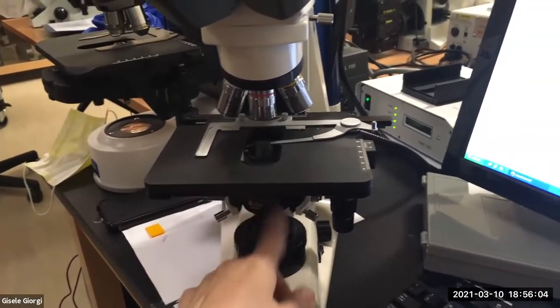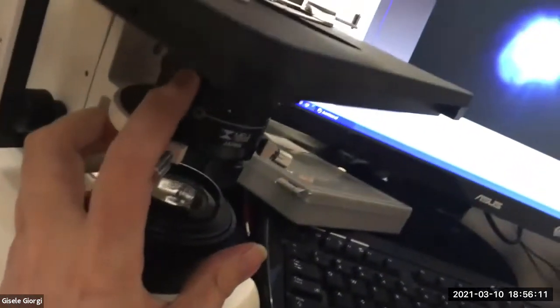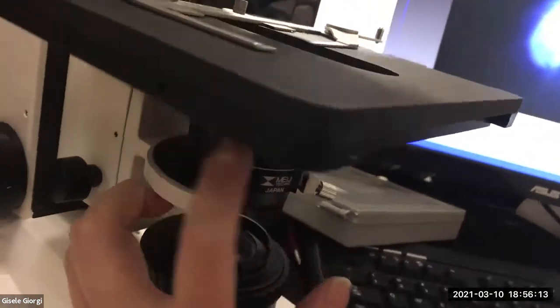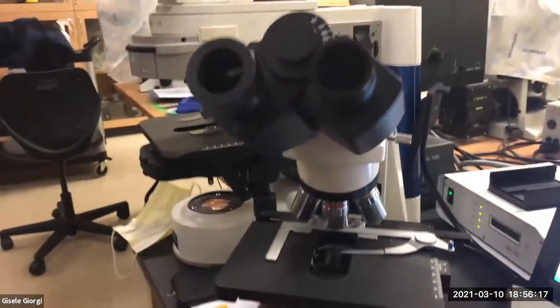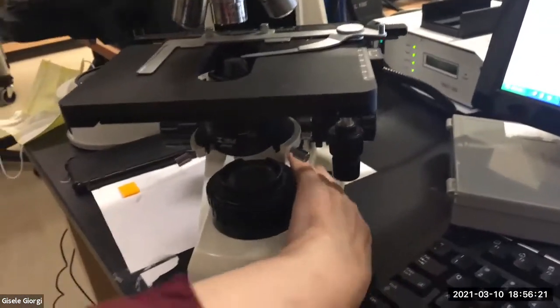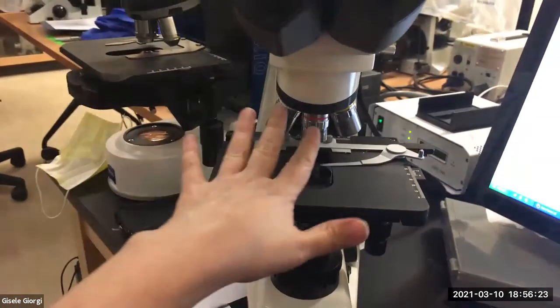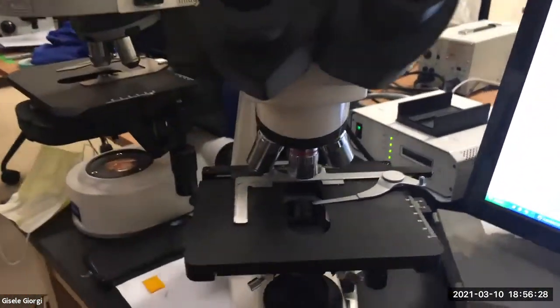And also once you start imaging various things, you're gonna always play with the iris condenser right here. Hope you can see that, yep, iris condenser. And just do whatever works best. If you wanna keep it open, it looks great; all the way shut, play with that. Play with the rheostat, play with your mag, and find great things through your scope.